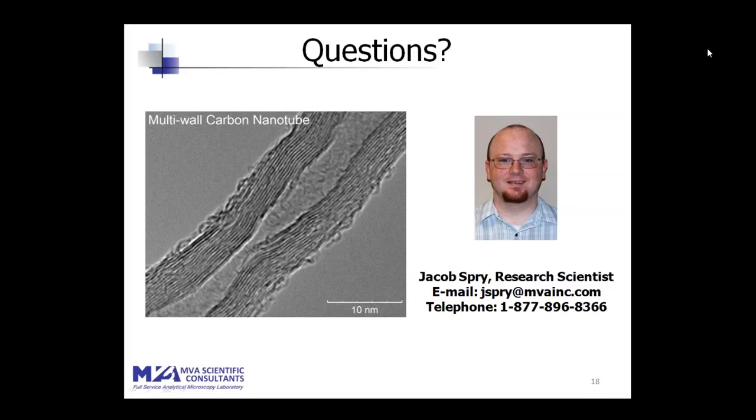The short answer is that it depends on the material that you're looking at, how much you can trust the EDS, and that depends on both the user and the sample. It's probably not the very best approach to take if you really want a very detailed, thorough evaluation of what the chemical makeup is of a material that you're submitting.